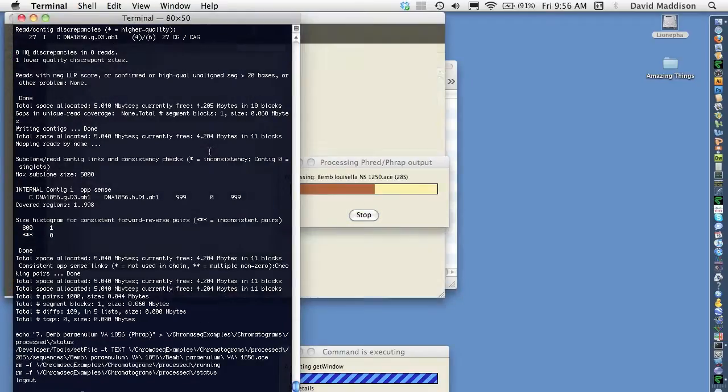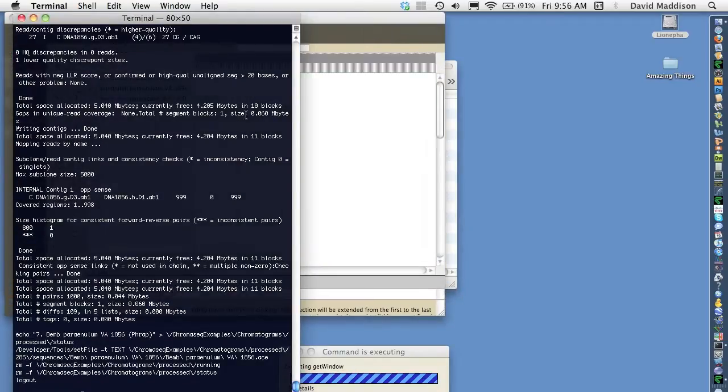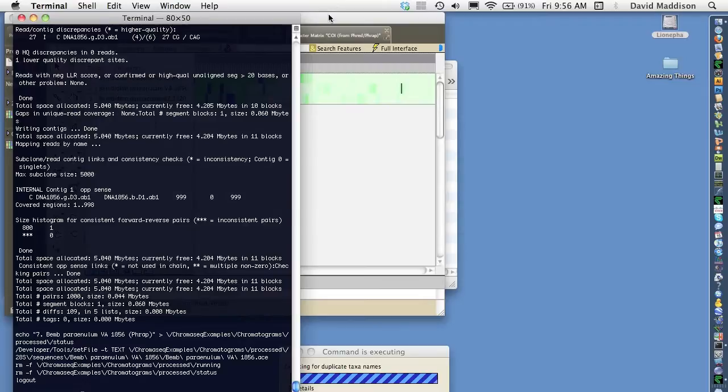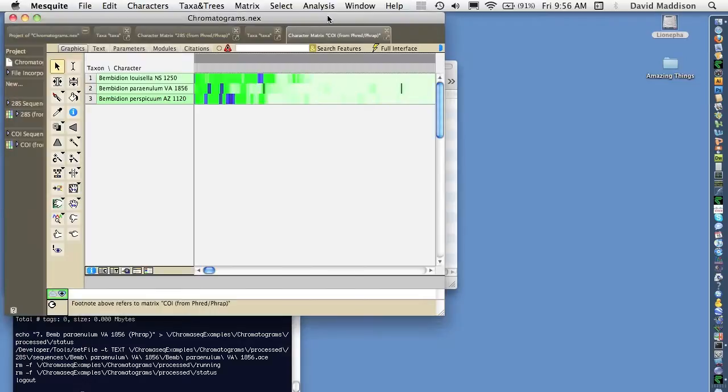So ChromaSeq is scripted fred and frap to make base calls and do contigging. It's pulled in the results, done some necessary post-processing like trimming and changing things to ambiguity calls as needed.